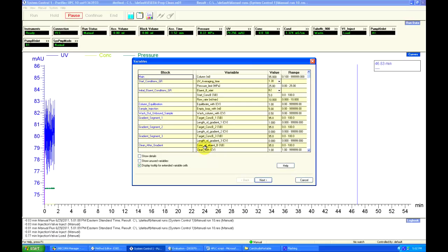The next window shows variables that one can change about the run being done. One variable to take note of is in the sample injection block. It's called empty loop width. This value in milliliters depends on the size of the sample loop mentioned earlier. It simply washes the sample loop with the inputted amount. We usually want twice the volume of the sample loop, and sometimes even a little bit more for bigger sample loop volumes. This is to ensure that the sample is completely washed out of the sample loop and transferred into the column.